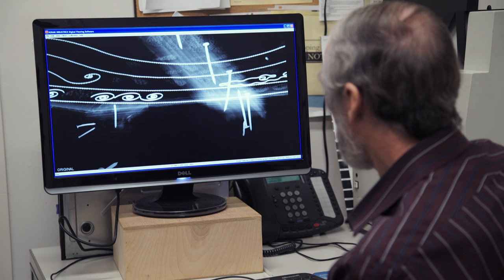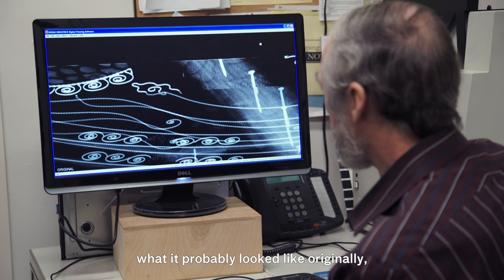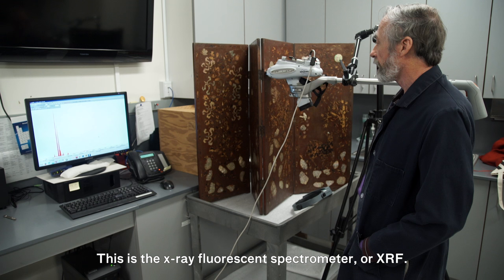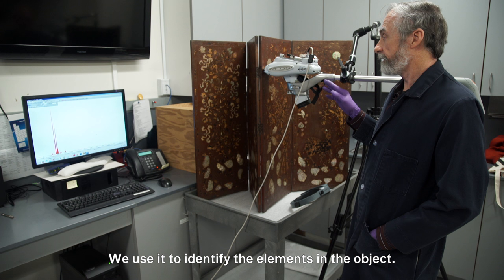All these details will help us to decide what's original, what it probably looked like originally, and help us decide what to remove and what to leave alone. This is the x-ray fluorescence spectrometer, or XRF. We use it to identify the elements in the object.